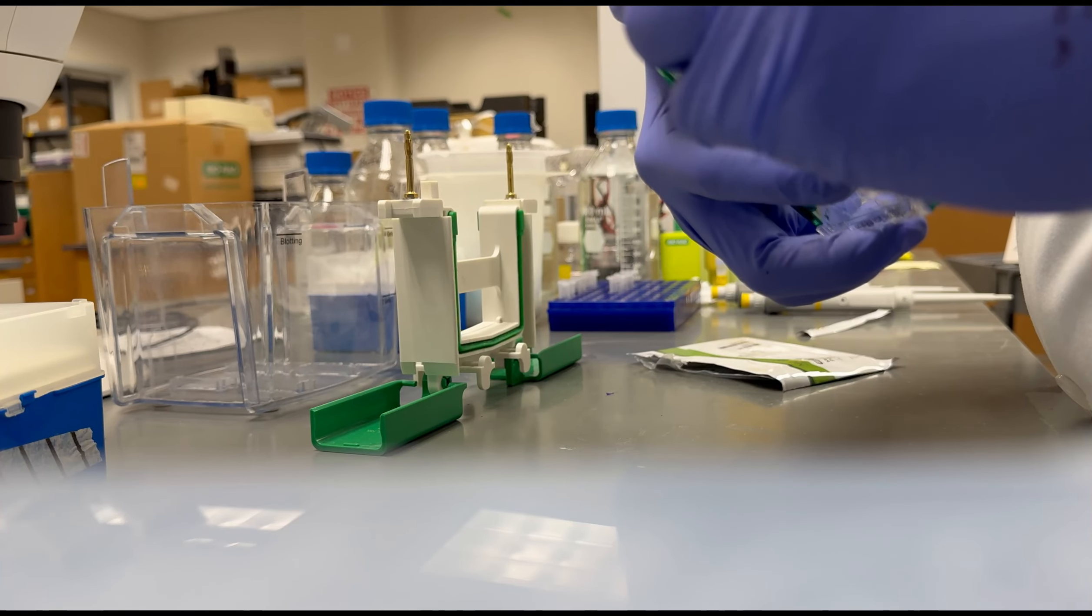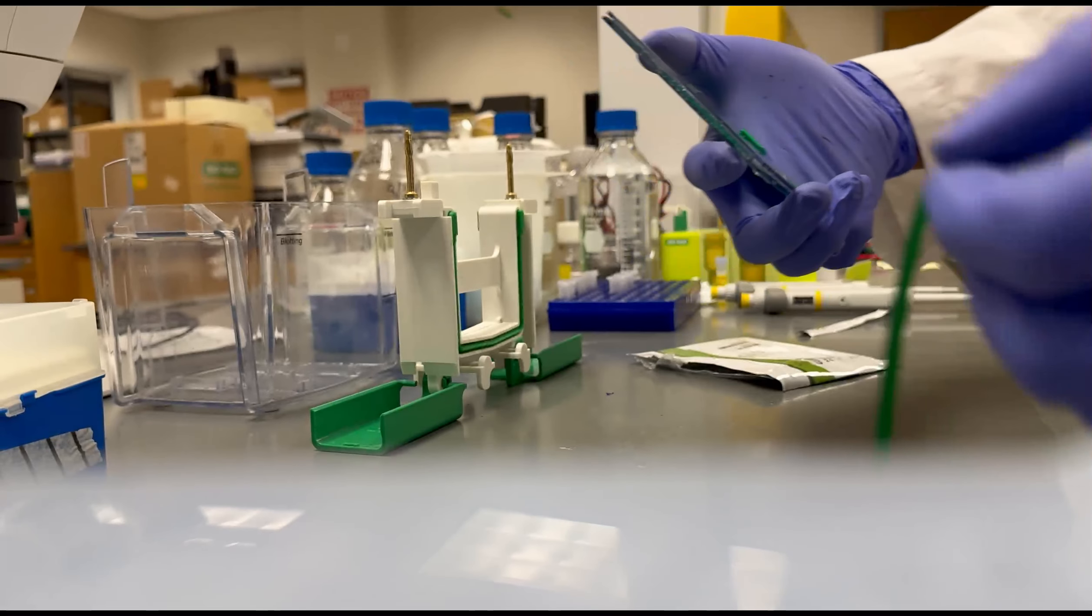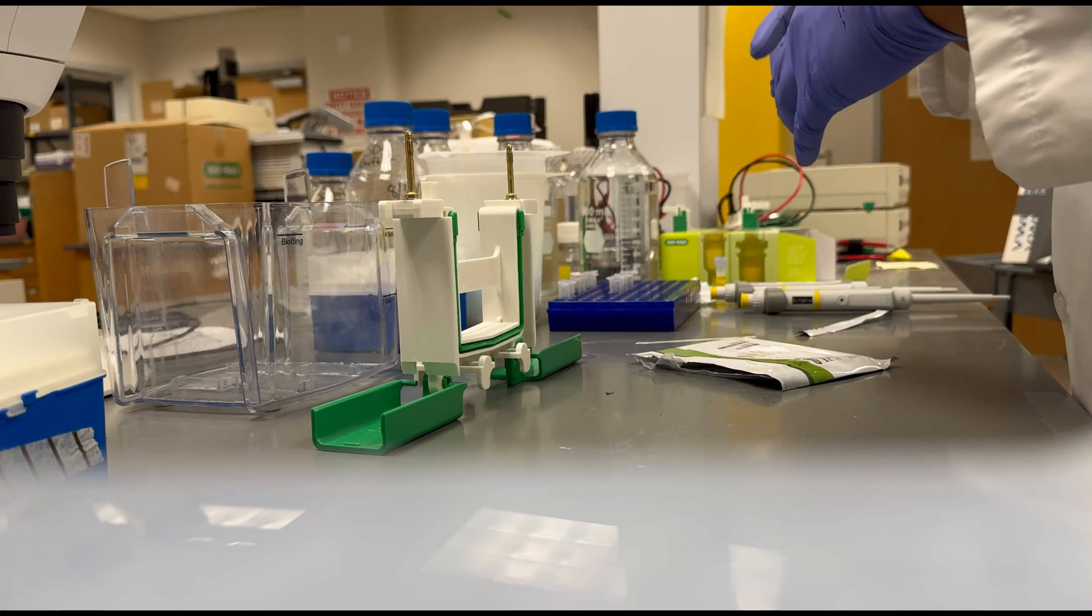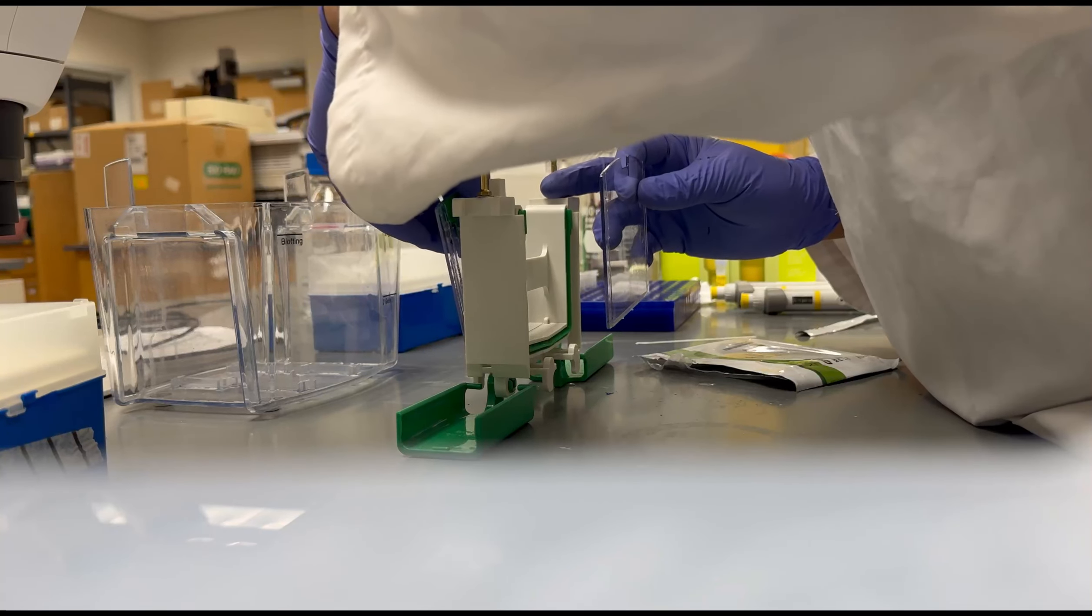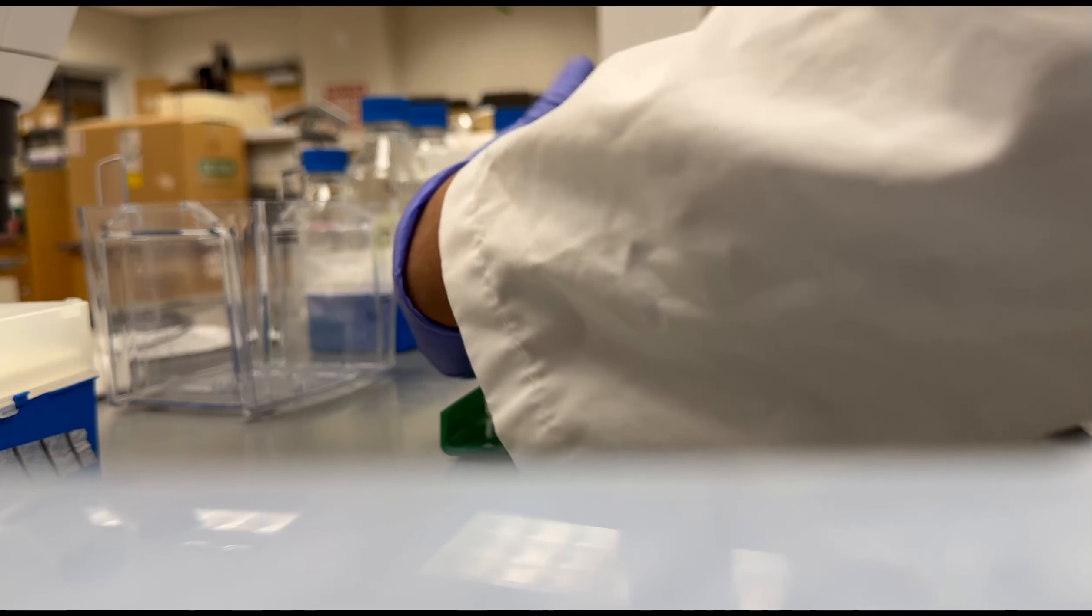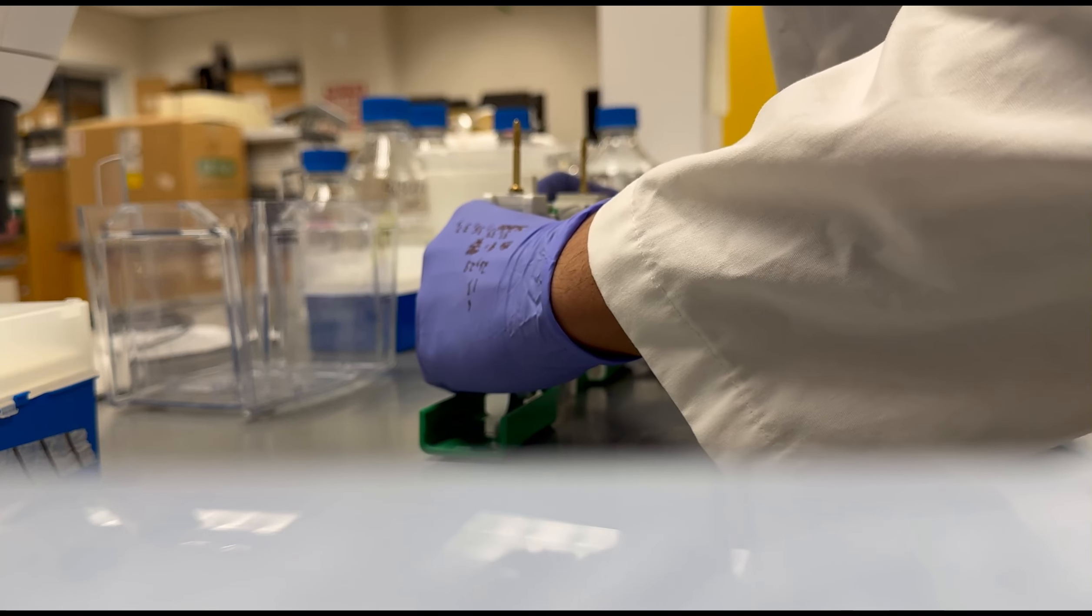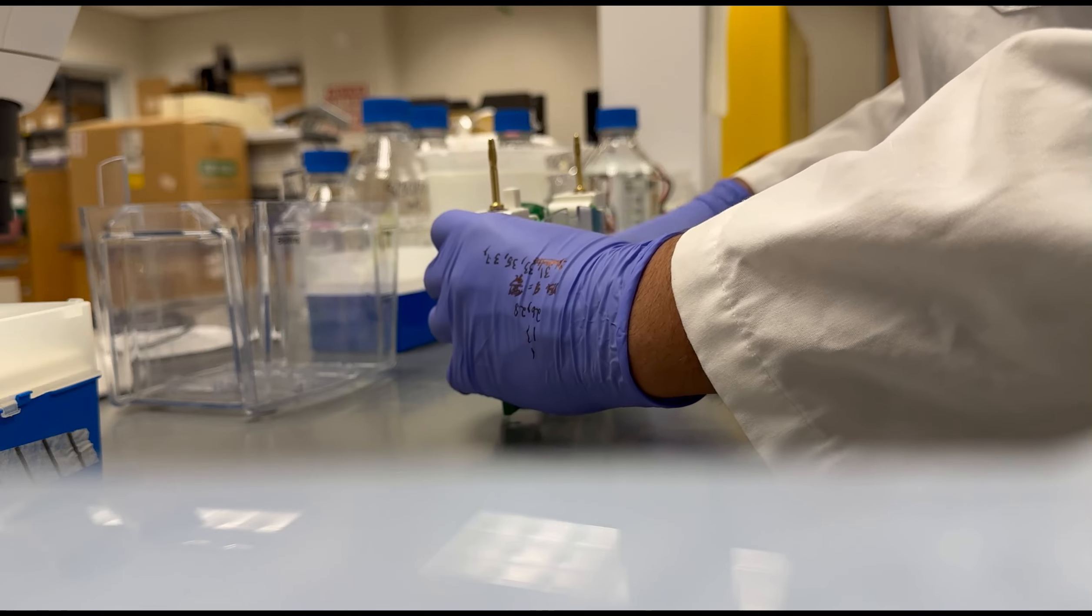The next step is loading a gel onto the electrode chamber. First, one must remove the green tape at the bottom of the gel to allow the contents to flow through. The gel plate and the buffer stop plate are then placed into the chamber. Once in the chamber, the green clamps are then closed on either side to secure the gel.